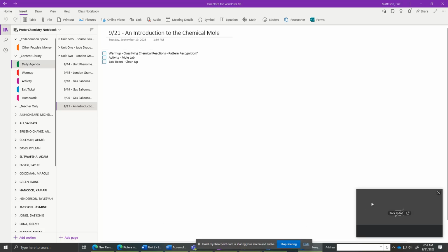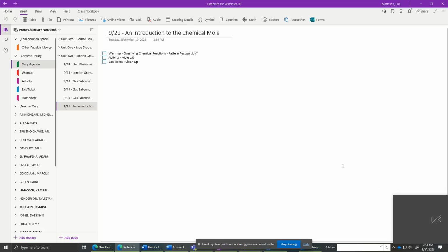Good morning, everybody. So today is another lab day. What we're going to be doing today is an introduction to the idea of the chemical mole. We're going to introduce this idea using a lab in which we take some common food items, in this case rice and beans, black beans and brown beans. And we're going to simulate what chemists do to count atoms.